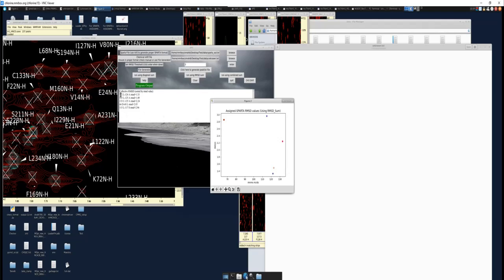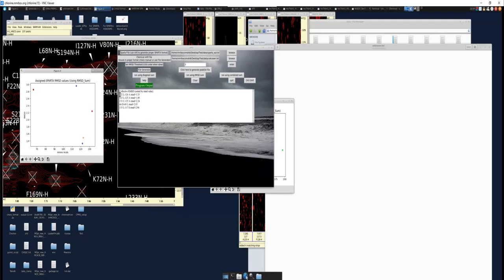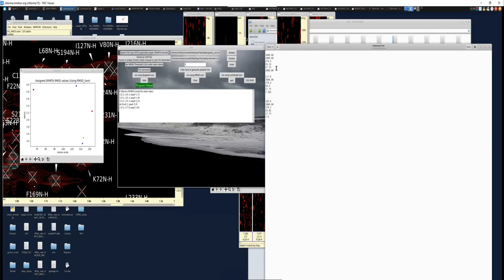And now we can see that in our RMSDs, now that 124A to 126 is completely gone. Instead, it's replaced with this 122 leucine to 124 alanine, 123 leucine to 125 alanine, and a 133 to 135, right? So we know this also is not the match because we know our very first amino acid right here at the top is an alanine, not a leucine or a cysteine, right?